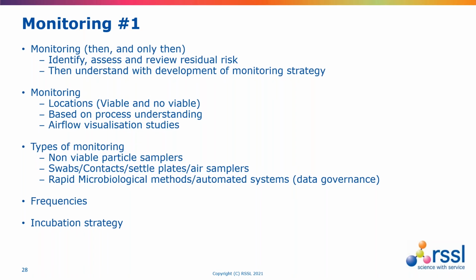So this brings in the interesting area, which unfortunately we don't have time to go into, but it's about whether we use 1 or 2 culture media. If we use 1 culture medium, are we going to put that into dual temperature? If we're going to do dual temperature, what's that order of incubation, and so on. But they're examples of things that need to be drawn out.